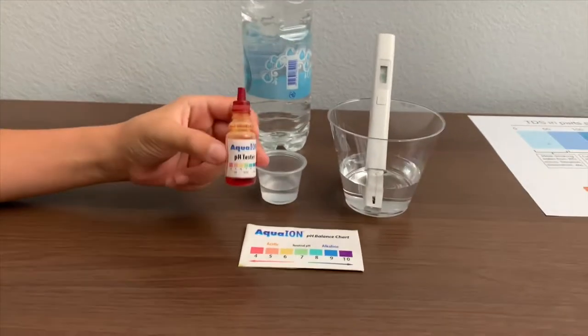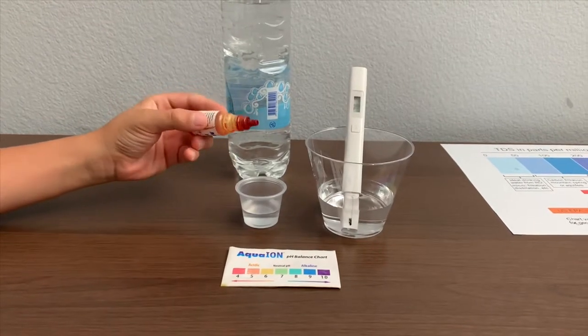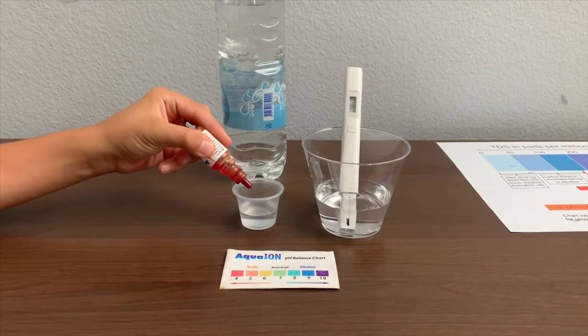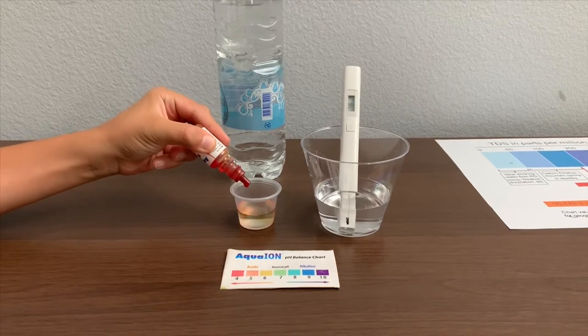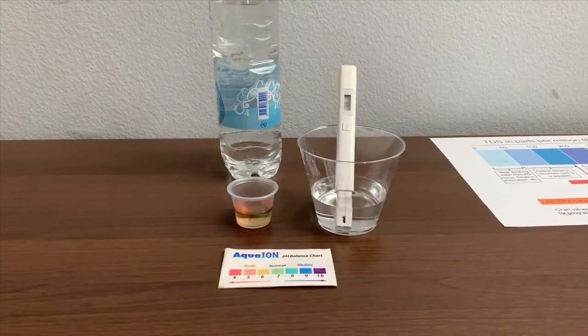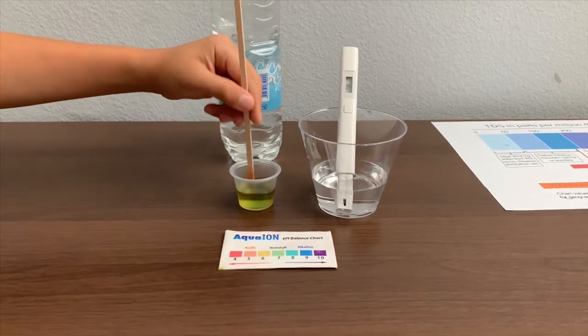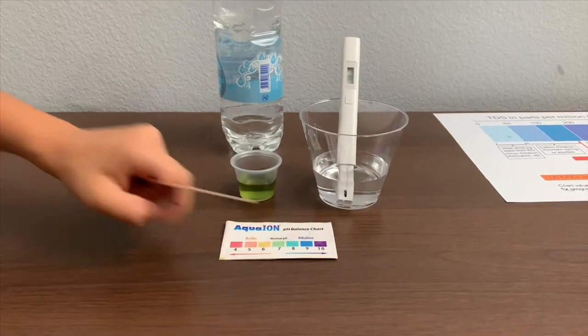Now let's test the pH level. If you want to buy this pH tester, check the link down below. Only do two drops. Let's stir it a little for a better result. I give this a 7 — this is neutral pH.